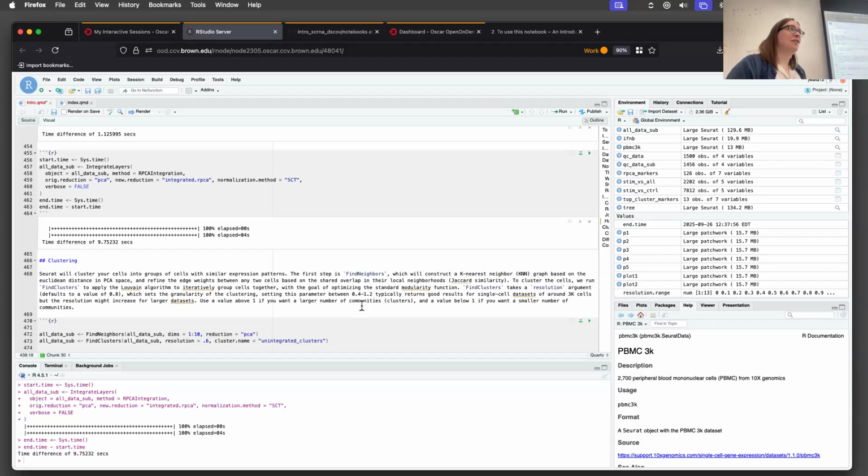Yes, kind sir. When you say try all of them and see, when doing that, do you have to do something equivalent to type 1 error correction? Paul asks if we need to do some sort of type 1 error correction if we're playing with all these different integration methods, and I don't know the answer to this question. I feel like I should ask August and Jordan about this because they'll know.